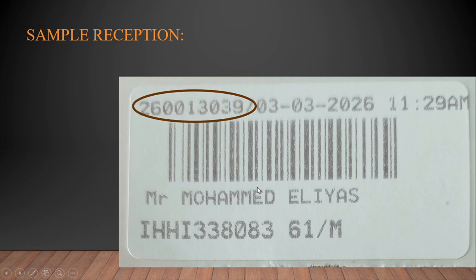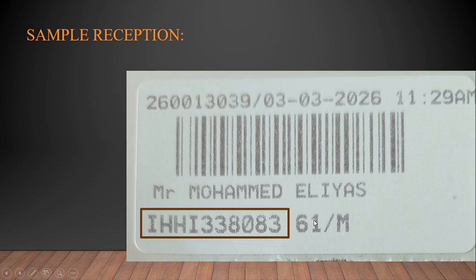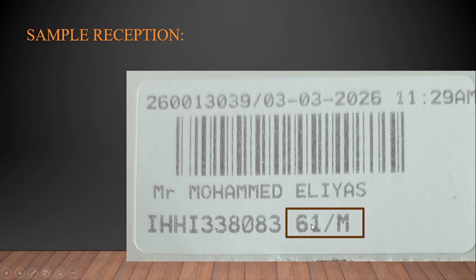So let us understand a little bit about our barcode also. So this is the request number. Okay, so it changes every year. Of course, this is a dummy barcode, so don't worry, dummy names and all. So this is the request number, and then this is the date and time at which the sample has been received by us, the barcode, the patient name, the UHID number, and the age and sex. So usually the age always comes in years only. So if the baby is in days and months, this area comes as -1 or 0 or something. So at that time we have to check the HIS, and go along as per that.